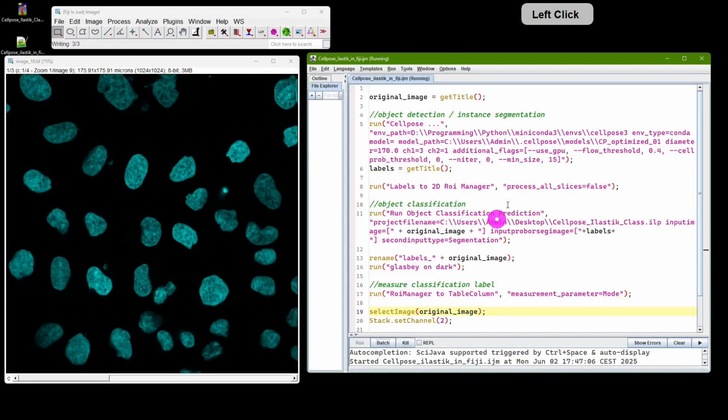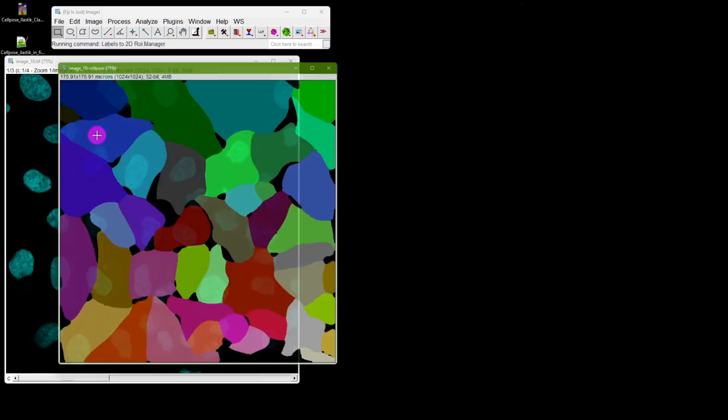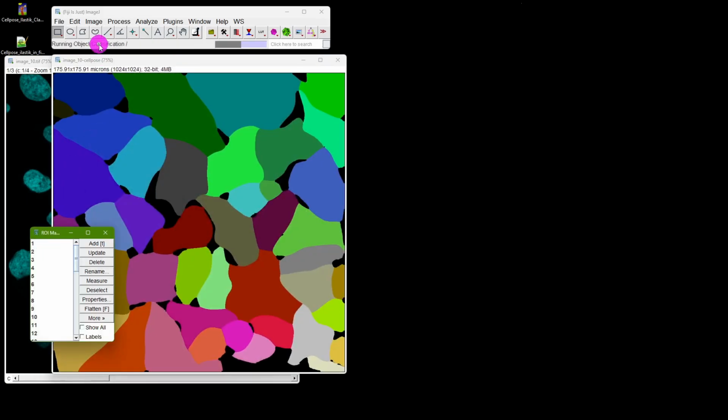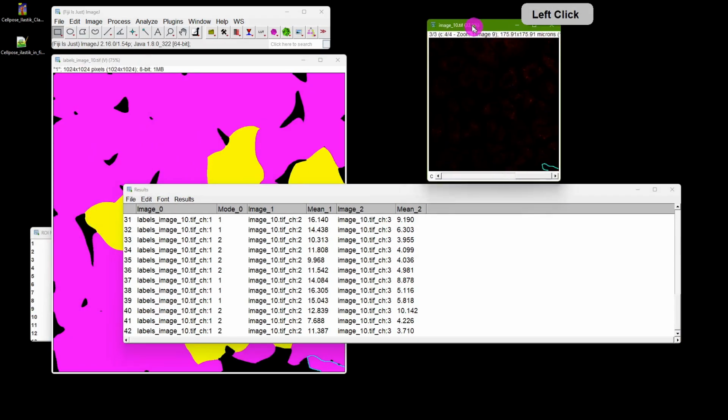Later in the course, we'll combine deep learning-powered cell detection in multi-channel images with previously established object classification procedures to build a complete analysis pipeline from raw image pixels to detailed object-level patterns.